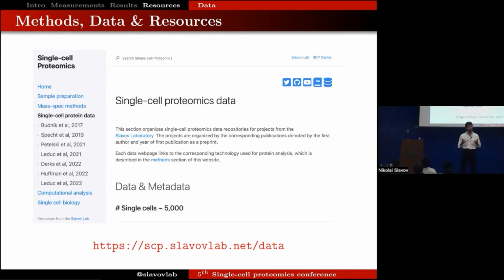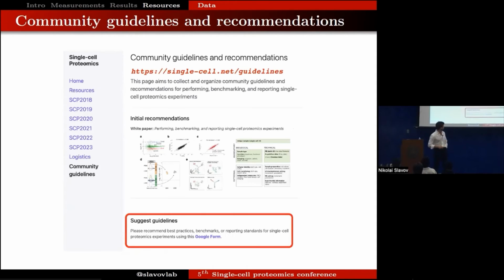So we think a lot of the growth that we had seen in single cell RNA sequencing is going to also come to single cell mass spectrometry. Not necessarily at the same rate, at the same scale, but we are going to see very large data sets coming forward with thousands and tens of thousands of single cells analyzed.